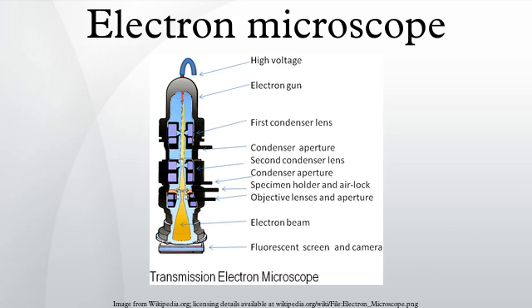Also in 1937, Manfred von Ardenne pioneered the scanning electron microscope. The first practical electron microscope was constructed in 1938, at the University of Toronto, by Eli Franklin Burton and students Cecil Hall, James Hillier, and Albert Prebus. And Siemens produced the first commercial transmission electron microscope in 1939. Although contemporary electron microscopes are capable of 2 million power magnification, as scientific instruments, they remain based upon Ruska's prototype. Types. Transmission electron microscope.